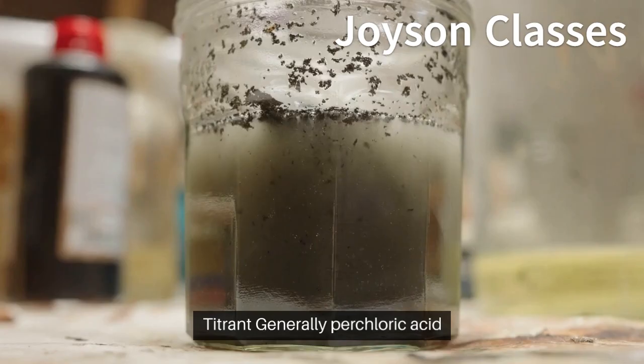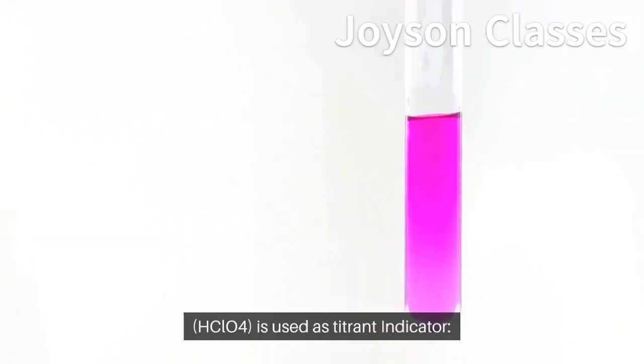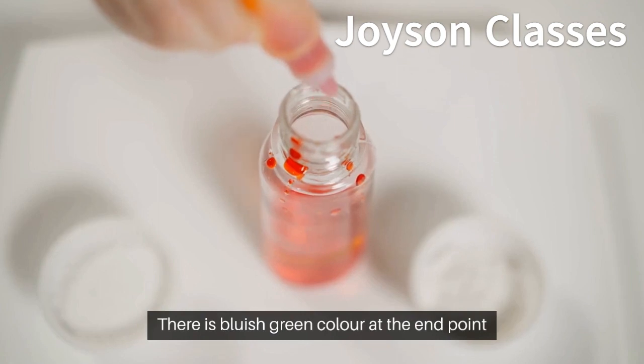Titrant. Generally, perchloric acid, HClO4, is used as titrant. Indicator. Acetous crystal violet solution is used as indicator. There is a bluish-green color at the endpoint.